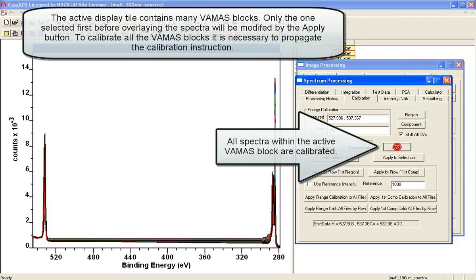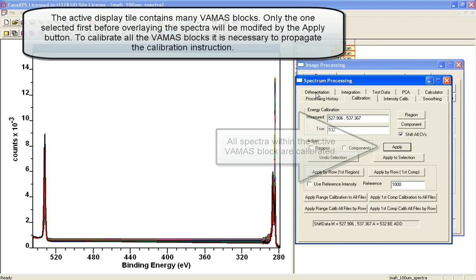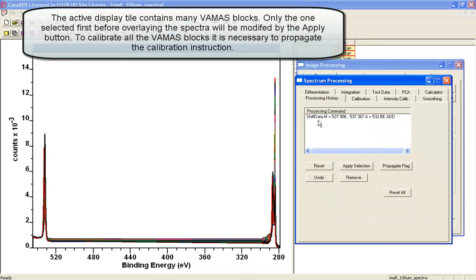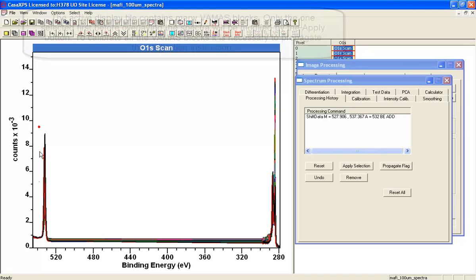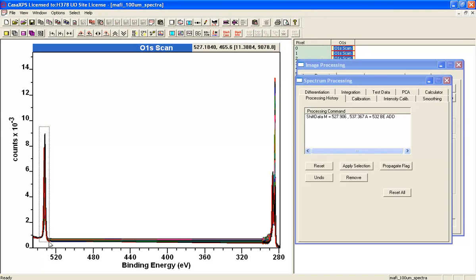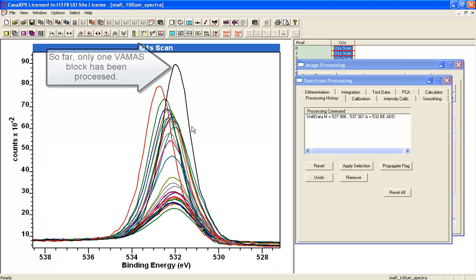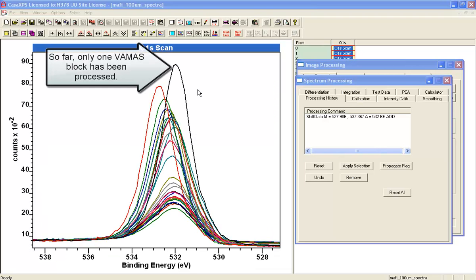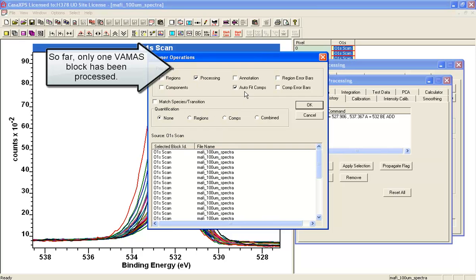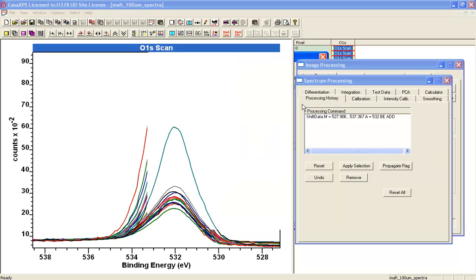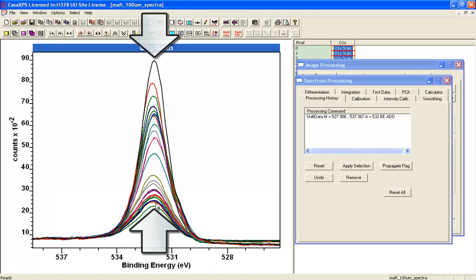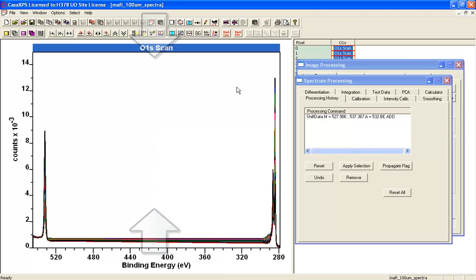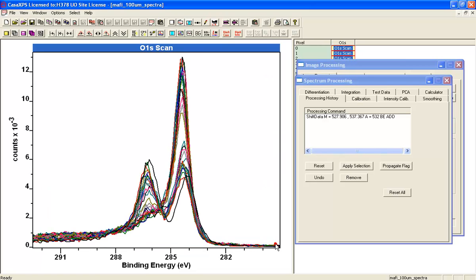What happens is I get in the processing history a shift data calibration instruction. If I select all of these spectra and zoom in so you can see, one has been moved. If I now propagate that processing and zoom in again, you can now see that the alignment has been made, and the alignment has also been made to these carbon peaks.